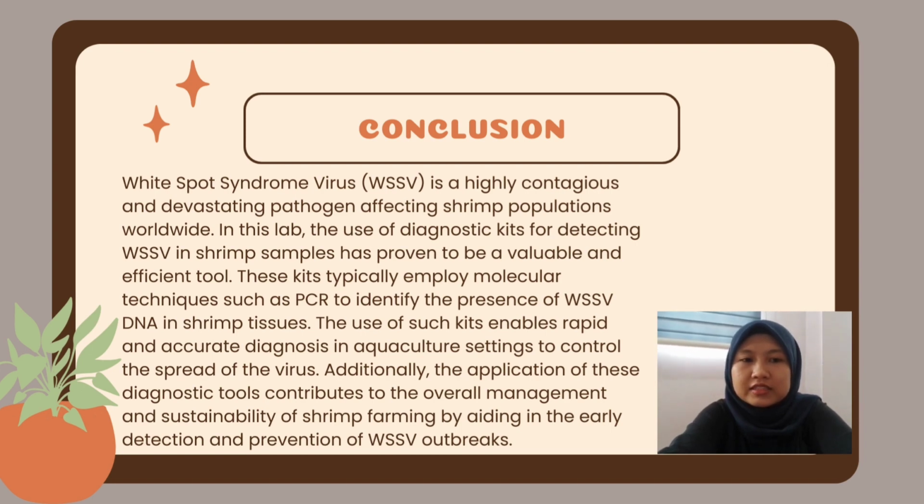the virus. Additionally, the application of this diagnostic tool contributes to the overall management and sustainability of shrimp farming by aiding in the early detection and prevention of WSSV outbreaks.